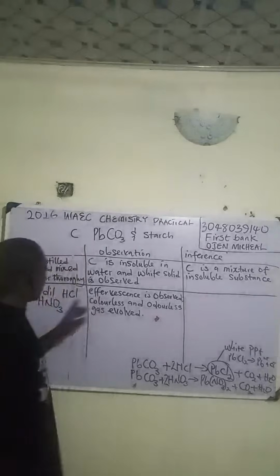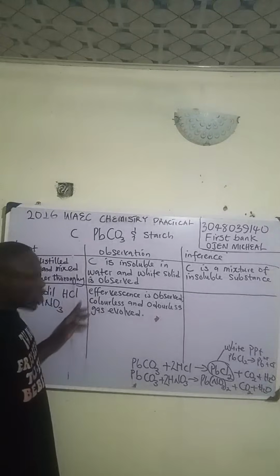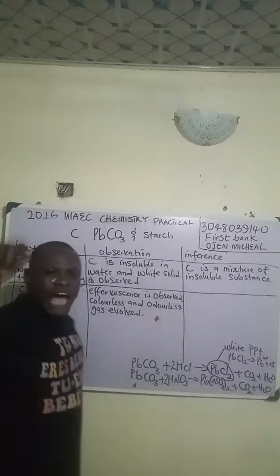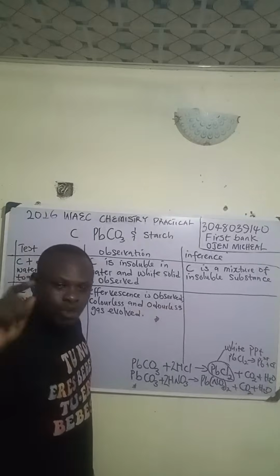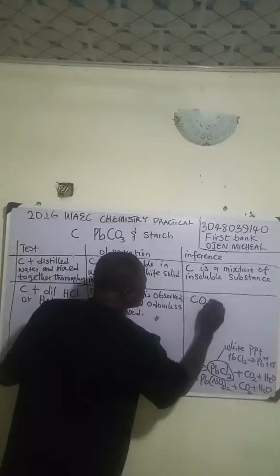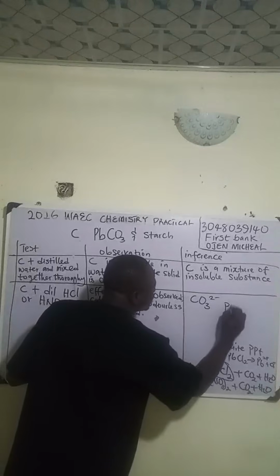Look at, if you add either this one or this one, effervescence is observed, and a gas will be evolved. A gas will be evolved. And that gas is what? CO3 2- is present.